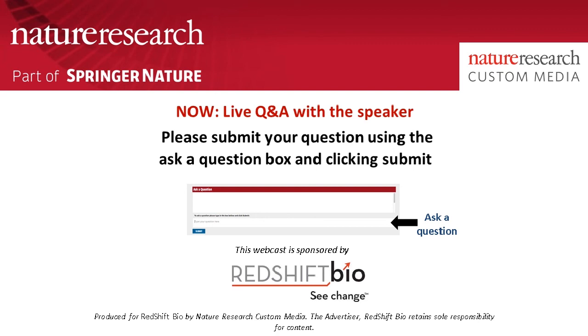Our next question asks if ThT can be a good assay for alpha sheet assessment, since ThT binds to beta sheets with low affinity for other conformations. From all of our experiments, we don't see ThT binding. If it's there, it's very mild. There's very little of it.